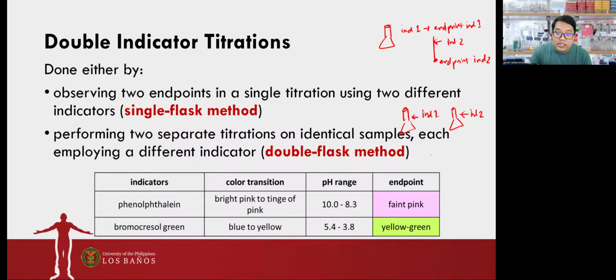As you can recall from your Exer 4A, pag alkali or pag basic, color pink ang ating phenolphthalein. So, since ang ating composition is composed of carbonate mixture, it has NaOH, sodium carbonate, and sodium bicarbonate. So, ito yung mga basic components natin. Basically, basic ang laman ng ating solutions.